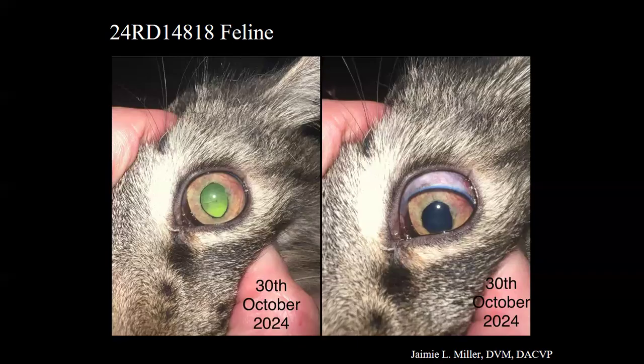We draw a little circle on it first with pencil, put the tissues in the middle of the circle and fold it up nicely and put it in a cassette for our histology team. So it's easier for them to find the tissues when they're that small. And ask them very kindly to try to do their best to stand these very tiny, small things on edge so we could get a good look of what we could of the tissue.